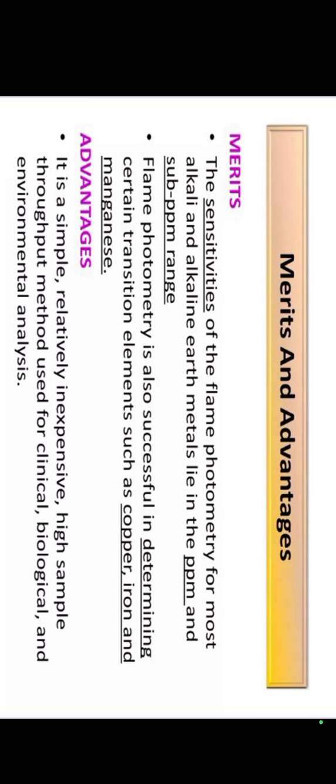The advantages are that it is simple, inexpensive, low cost, and a high sample throughput method. In flame photometry the sample throughput is high, so this is an advantage. It is used for clinical, biological, and environmental analysis. These are the advantages of flame photometry.